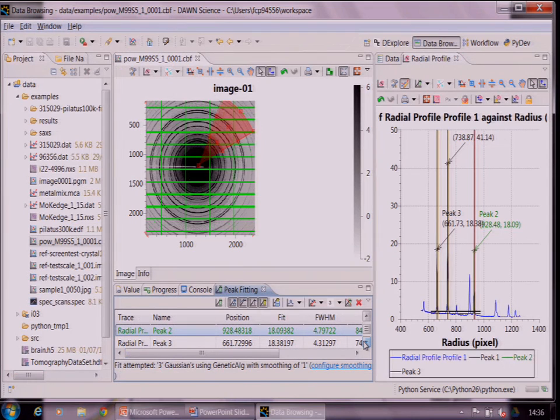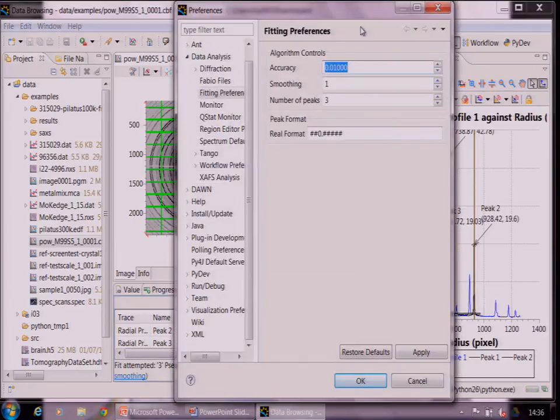Do you have several methods for peak finding? For example, first derivative, second derivative, or how is it done at the moment? Well, there are different algorithms that you map to. Pseudo-Voigt, for instance, is very useful. And then you've got various smoothing options, because you can get quite chunky data, so you want to try and fit based on that. So it applies a smoothing filter on the data first? Exactly. Yeah.